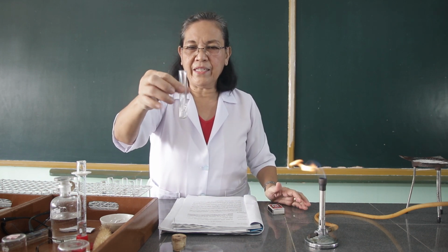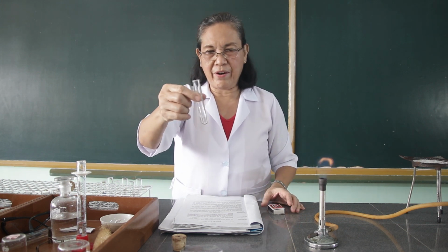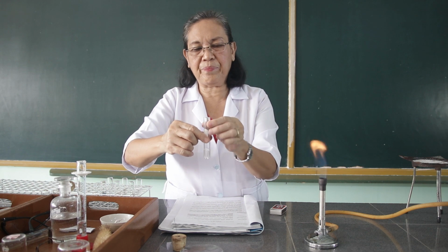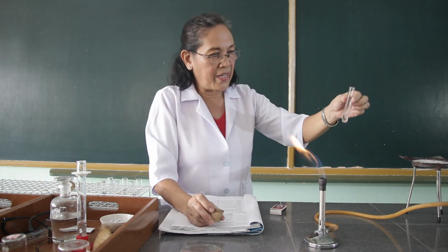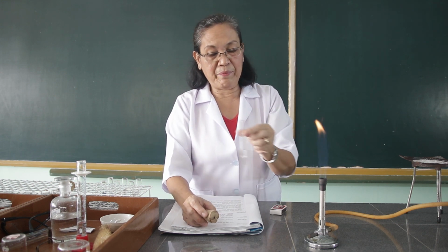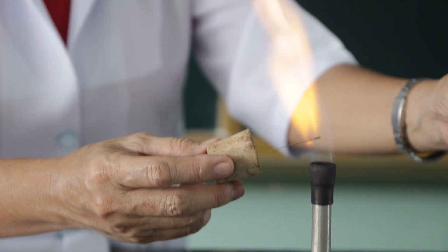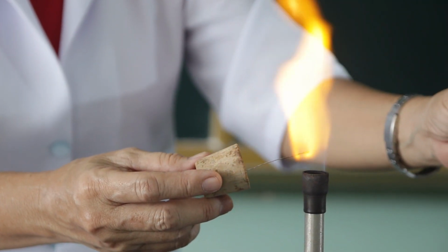So this is the mixture of the sodium carbonate, the water, and hydrochloric acid. From this mixture, this is already presumed to have the sodium ion. So we're going to test the presence of sodium using the flame test. So kindly observe. What color have you observed? I want you to observe the color imparted by the sodium ion. What have you observed to the color of the flame?